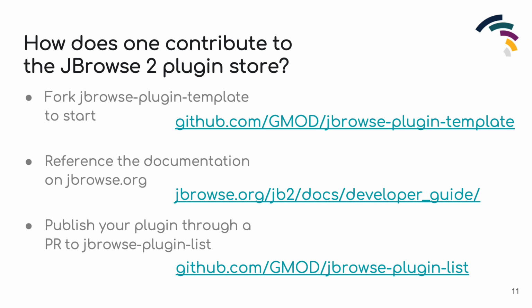On jbrowse.org, there exists extensive documentation regarding JBrowse's use of mobx-state-tree, pluggable elements, and how each component works together both within a plugin and with the broader JBrowse application. Designing a new view type for JBrowse 2 through a plugin is as simple as building a JavaScript component.